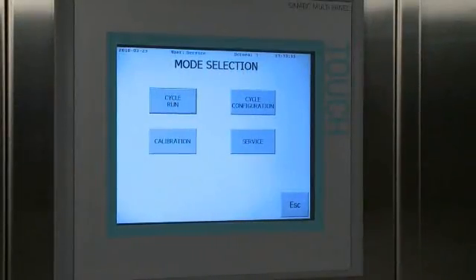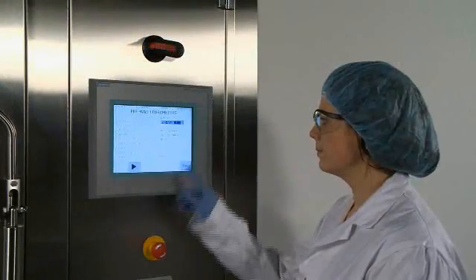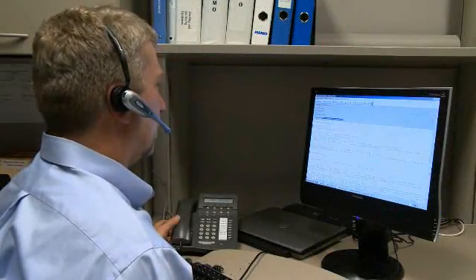The 680PG washer's advanced PLC control makes it easy to operate the system and monitor critical system parameters, and it can also be connected to the Steris ProConnect response center. ProConnect provides 24/7 remote equipment monitoring, helping reduce downtime and lower maintenance costs.